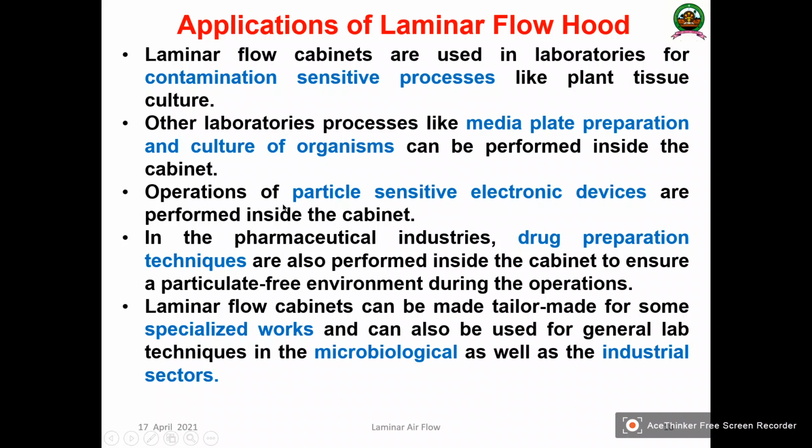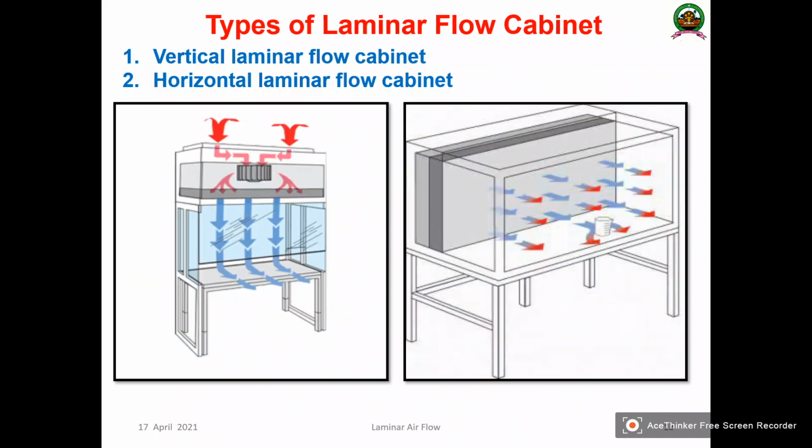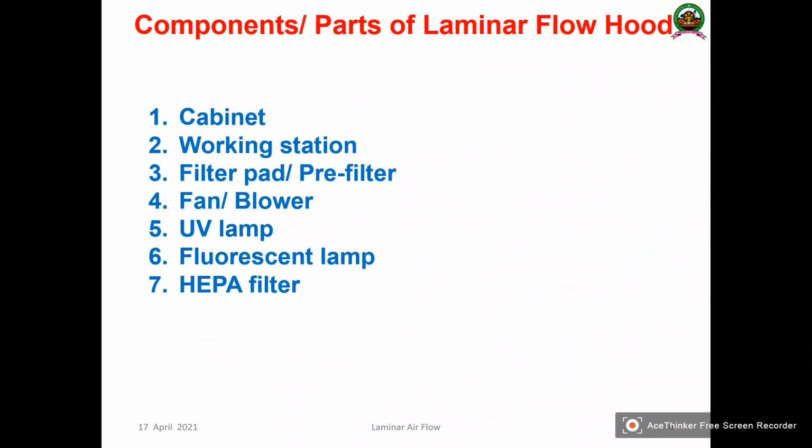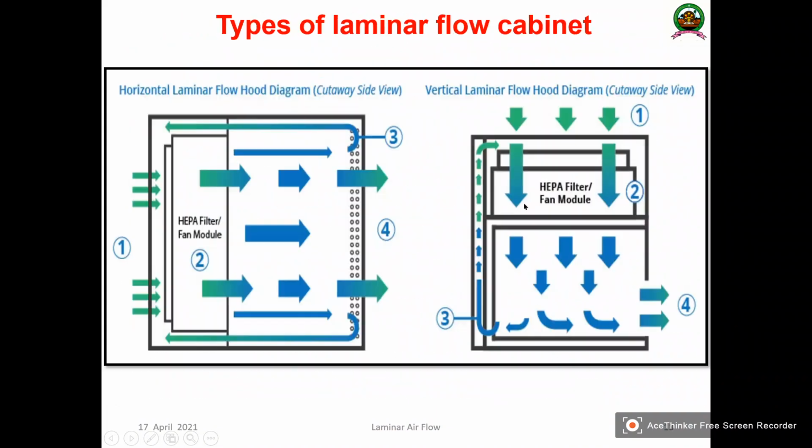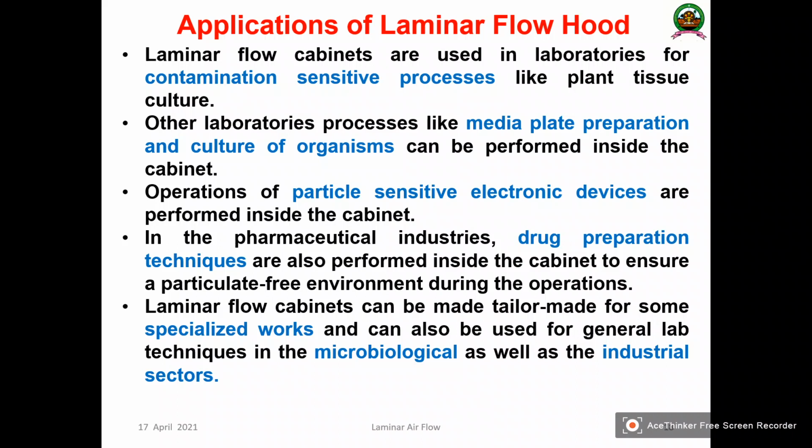The operations of particularly sensitive electronic devices are also permitted inside the cabinet. As you can see in the figure in the beginning, we can keep some of the instruments inside, and we can work with that instrument inside the laminar airflow.